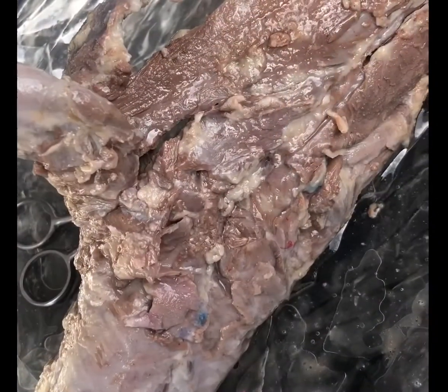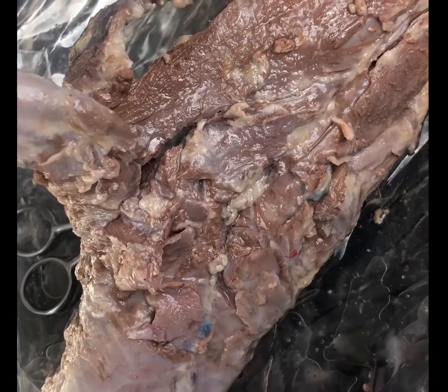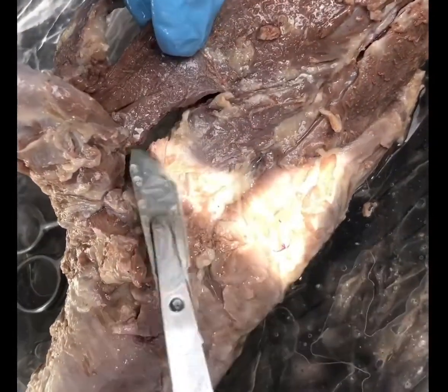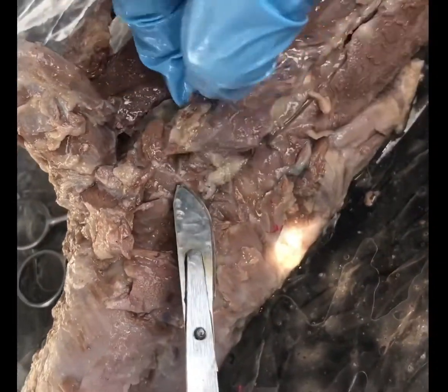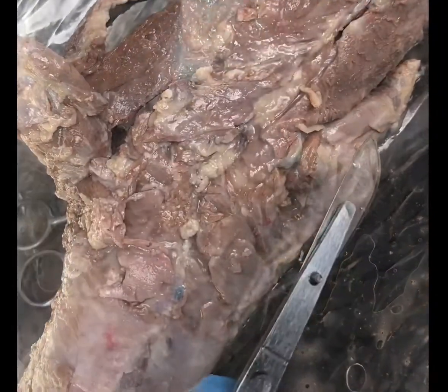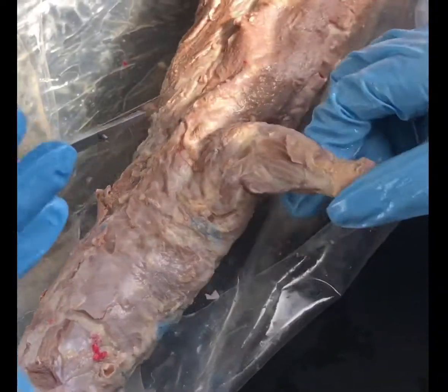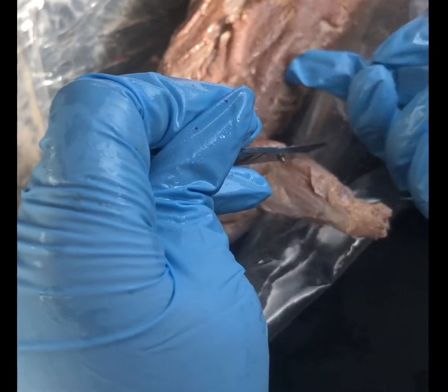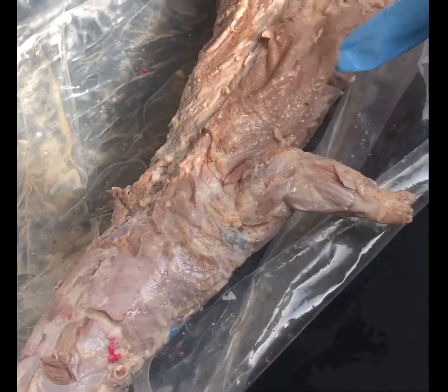Okay, the teres major adducts and medially rotates the arm, so it's gonna be this muscle right here. It goes like this. It's gonna be this right here. This muscle right here. Alright, this is the latissimus dorsi, which is basically the muscle that covers the back, like the side of the ribs area, this right here.